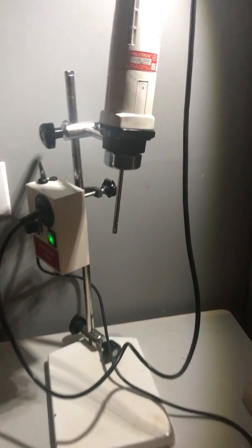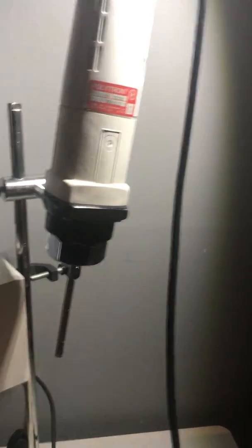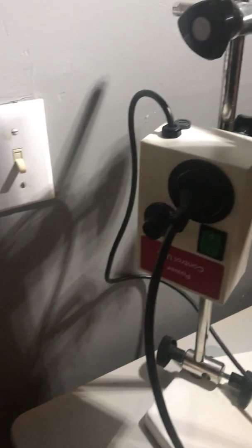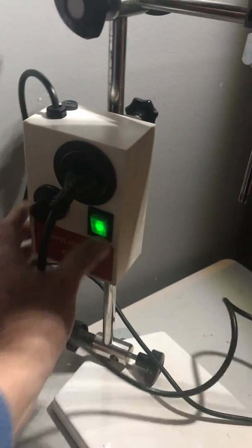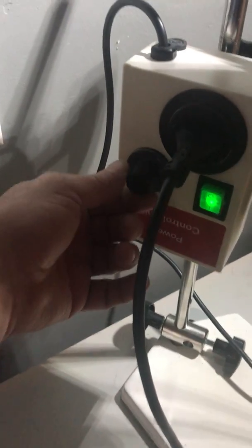Here we have a wonderful Polytron PT-1035. It works beautifully as you will see. Powered off and then powered back on again, so you can see.